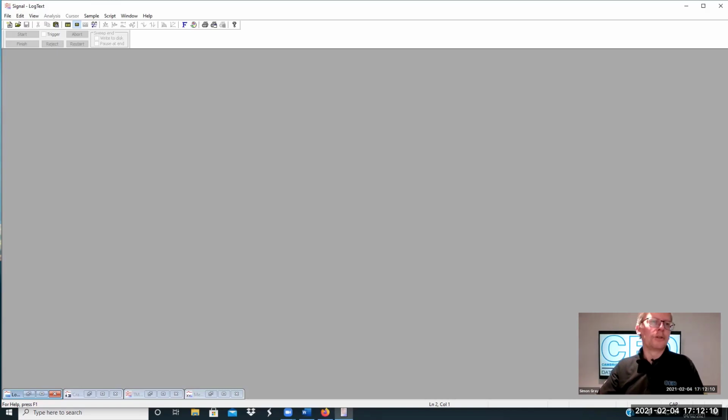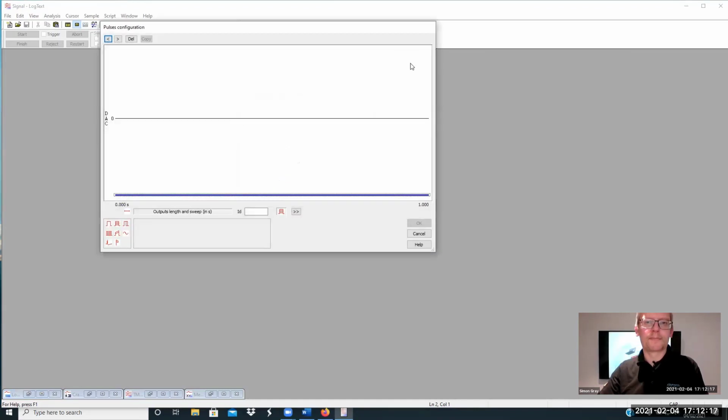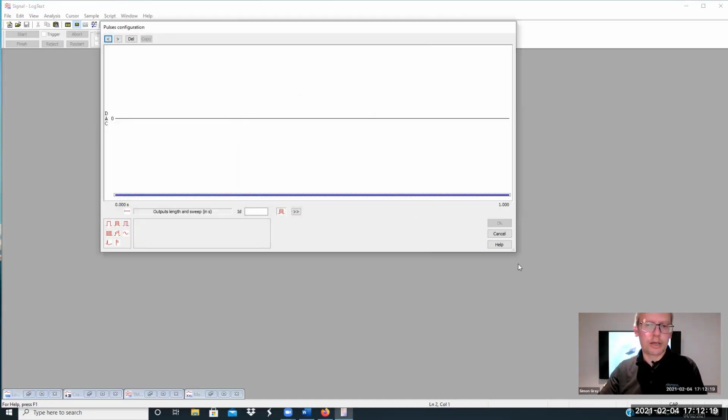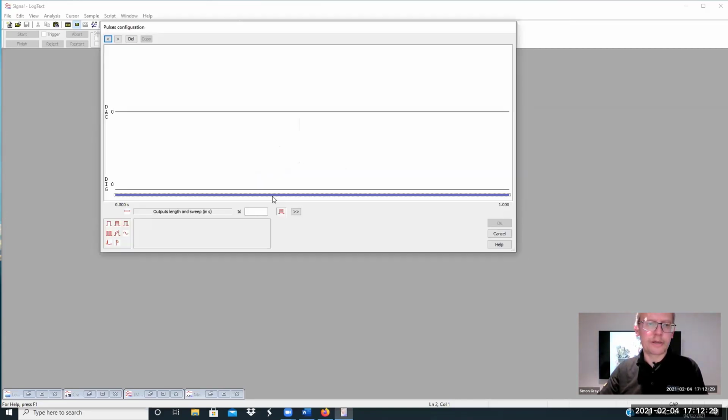I'm not quite sure what DIC might. I know where you are. You're looking at the sampling configuration and configure pulses. Right. So here we have DAC, digital to analog. If I add in one of these, we have digital outputs. So when I configure, we've got dig and DAC. Okay.